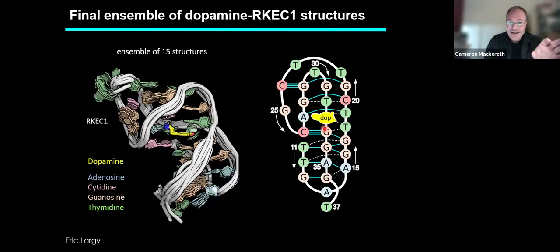And that's why we're glad that at the very start we did these very careful and unambiguous assignments of which signals came from which base, because of all those different oligos that we made. So we knew that there was no error in assigning which hydrogens were close to other hydrogens. This was all completely unambiguous. So we're glad we did that, because otherwise you start to look at this and think, wow, that's a very complex structure, but it actually fits all of the NMR information that we had. So it's a very confident but unusual structure.